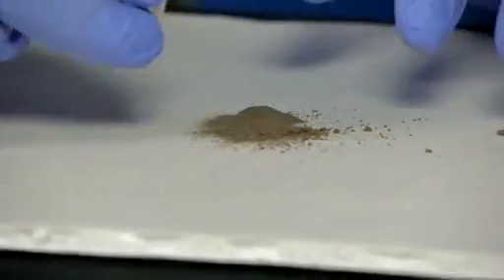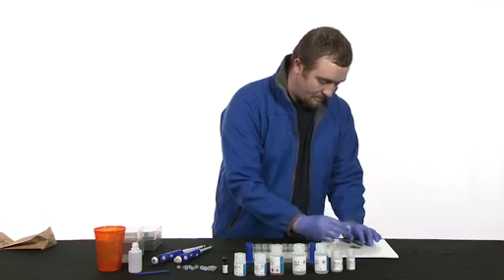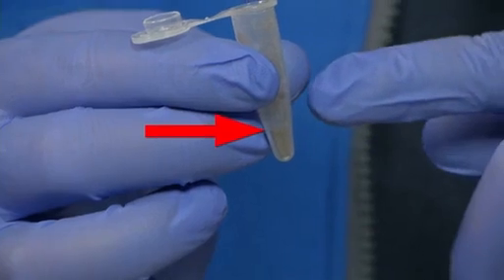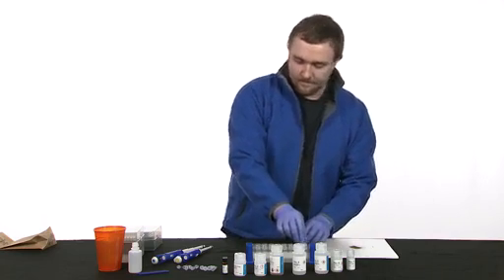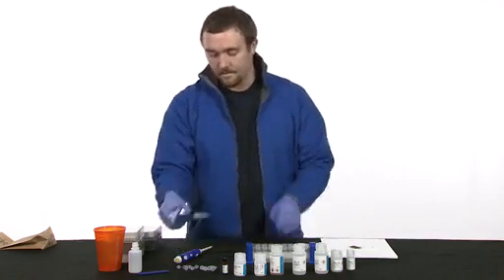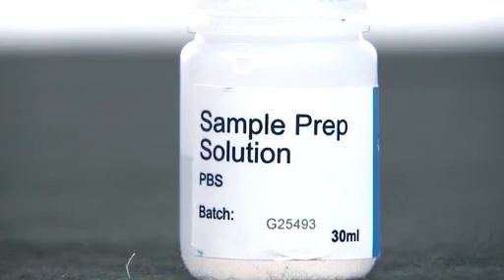Using a 1.5 milliliter microtube, measure to the 0.1 milliliter line, or about a quarter of the way up the tube with your soil sample, equaling to about 50 milligrams. Add 500 microliters of the sample prep solution.